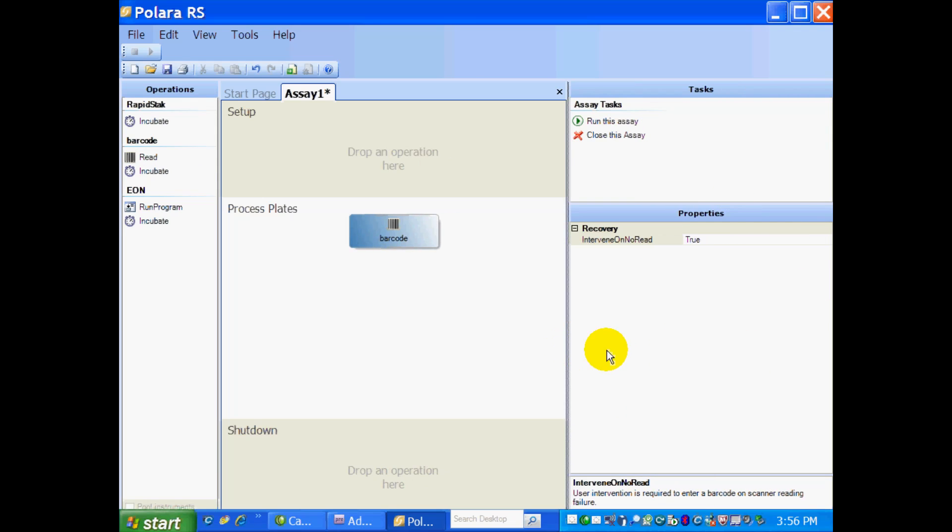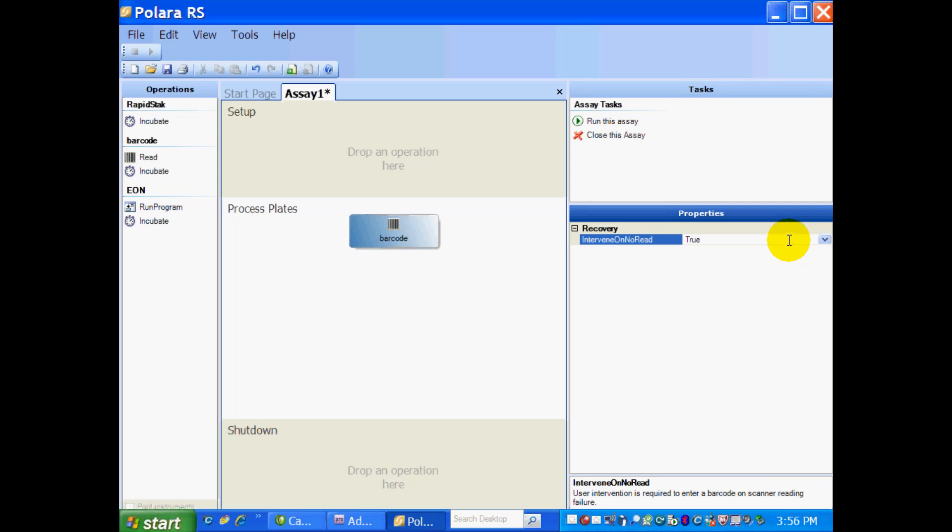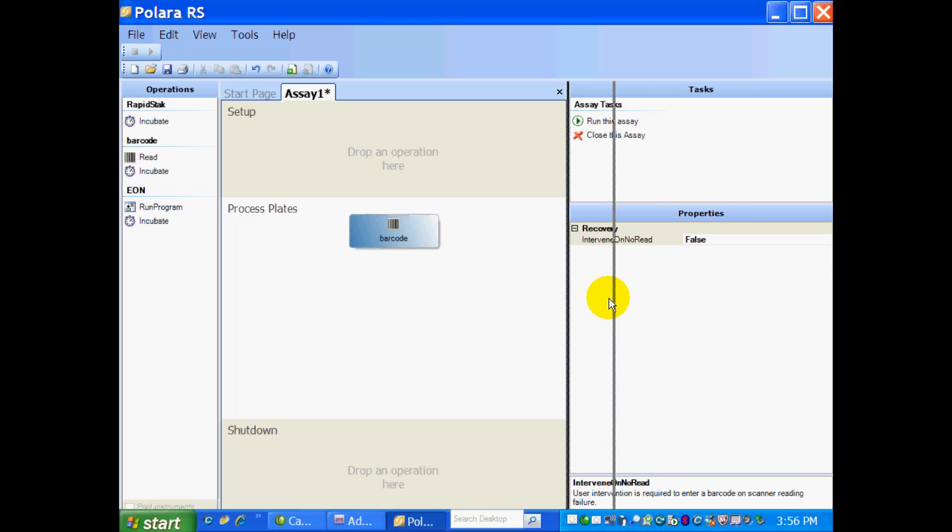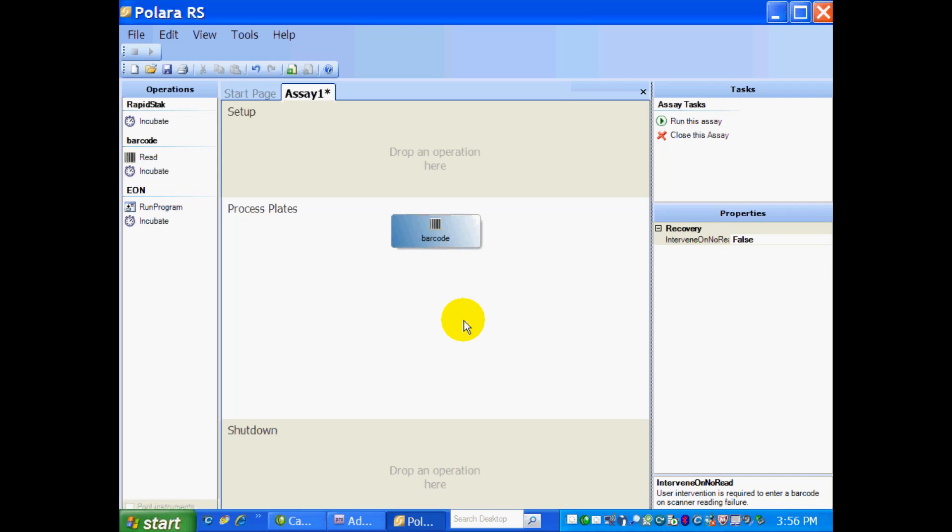This is asking if I want to intervene on a no-read. So because I have a barcode reader, if it does not read the barcode, do I want to type in some numbers? No, I don't. I'm going to hit False, and Polara RS will just set some numbers for me because I want to walk away. So that's far more convenient.